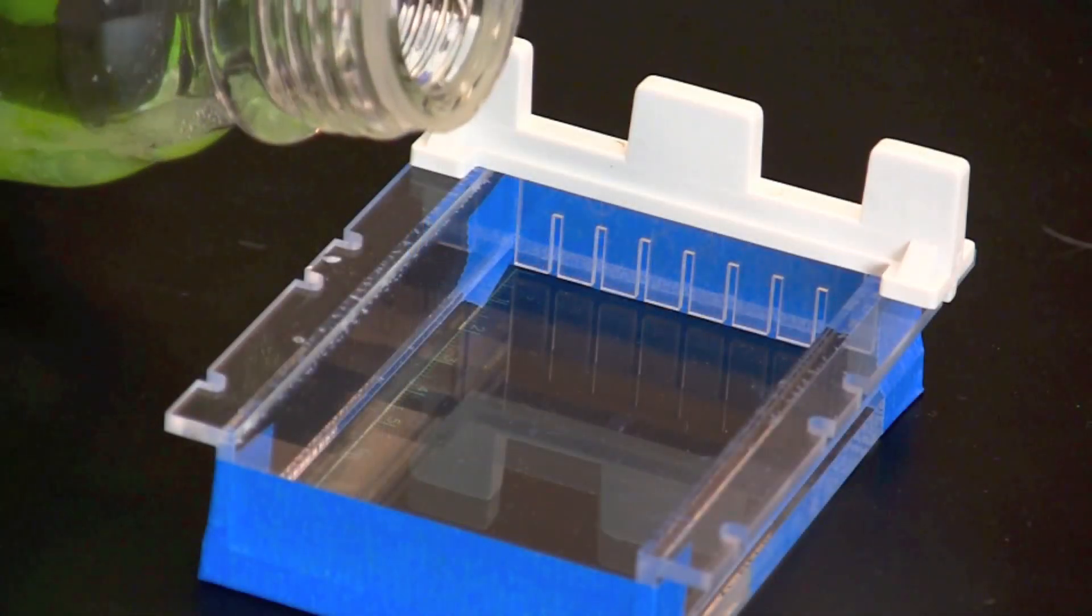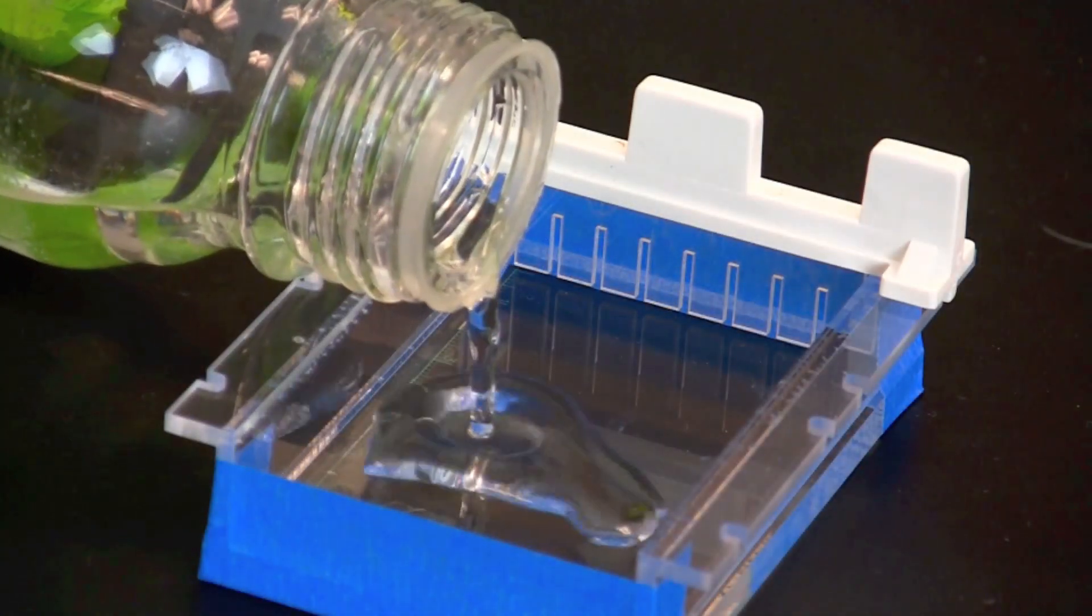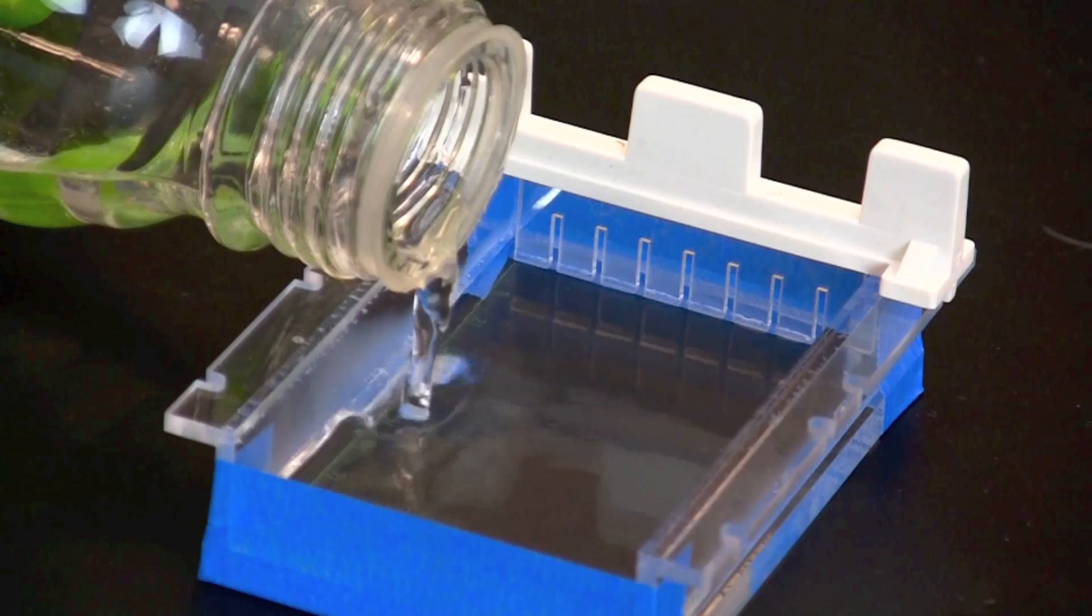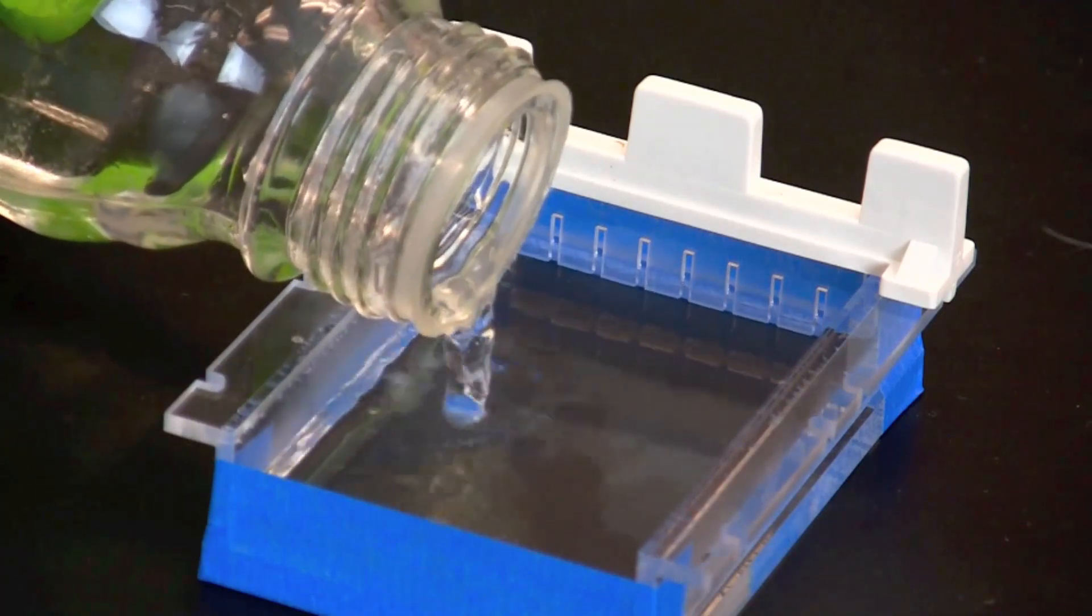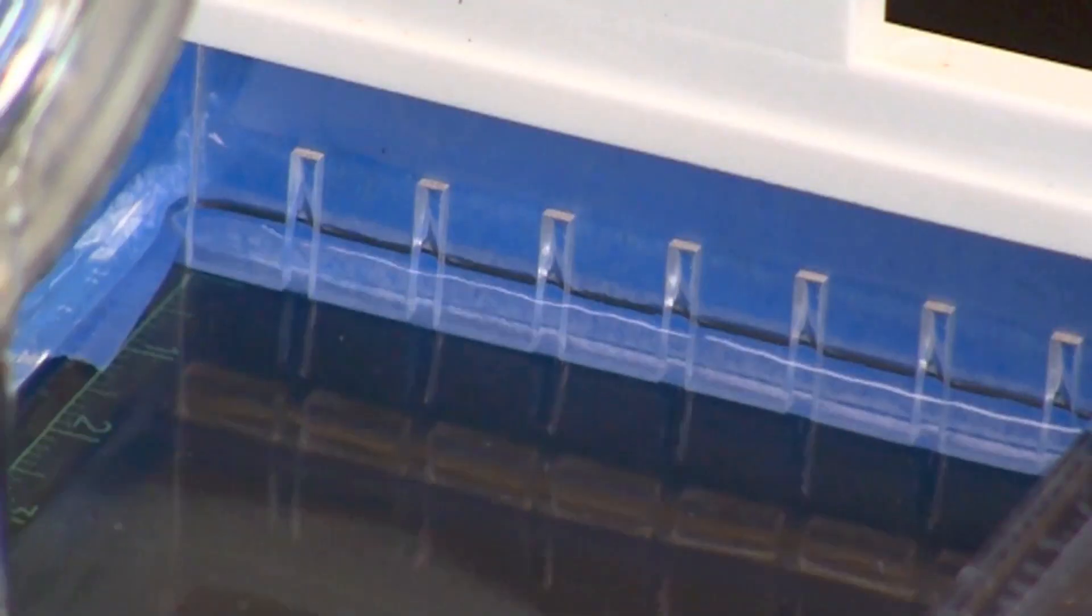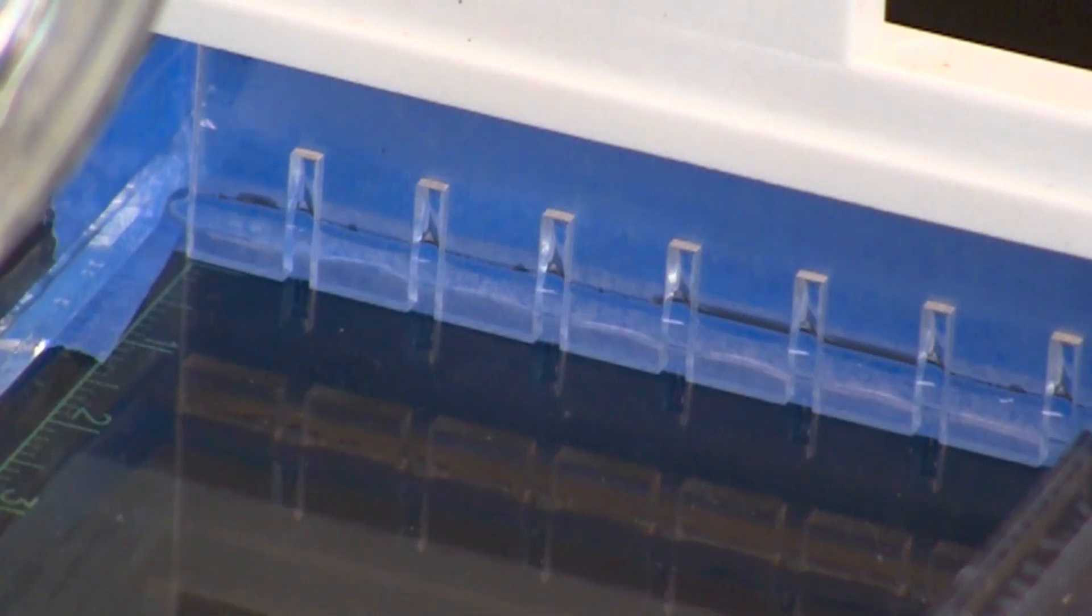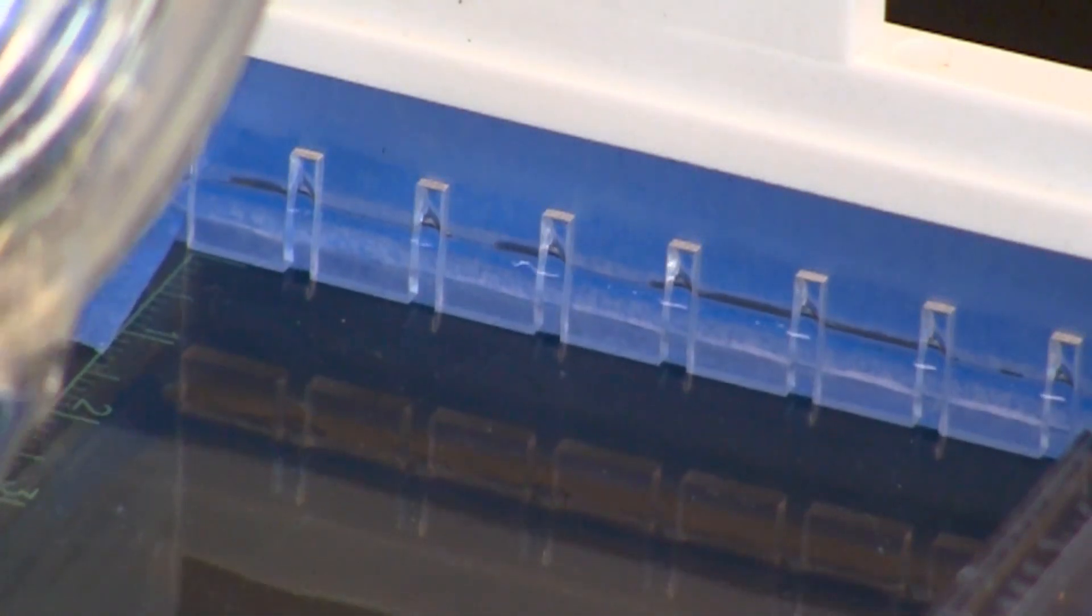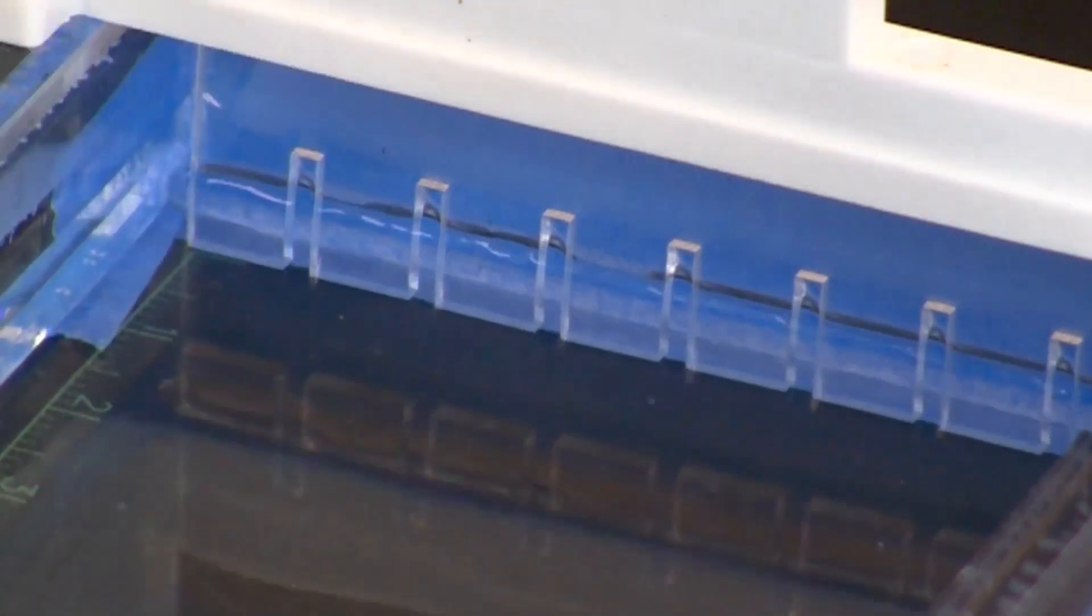Before pouring the molten agarose, make certain that it has cooled to 55 degrees Celsius. Pour the agarose into the gel tray until the agarose comes to within 2-4 millimeters of the top of the teeth of the comb.